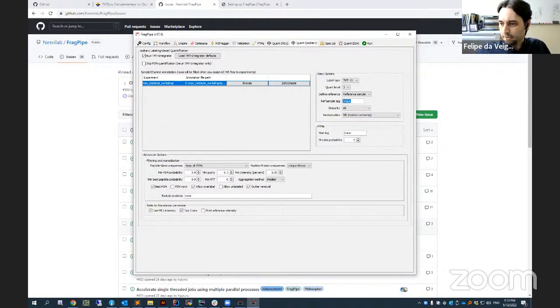Someone is asking if we have an output. As Fengchao is going to finish the settings of the program, we're going to show what the TMT tables look like, and we're going to go through them in detail.